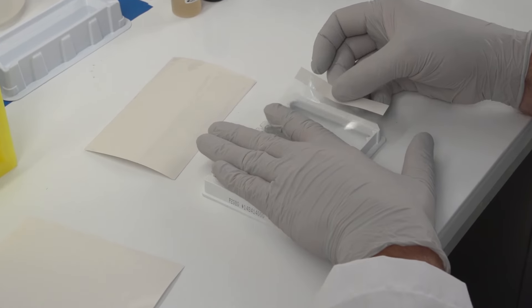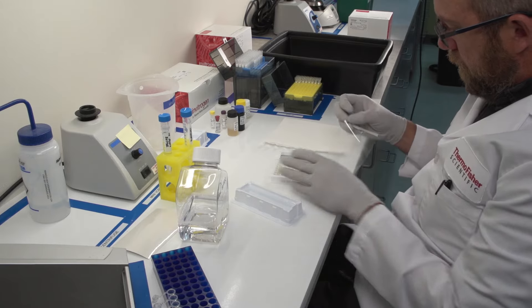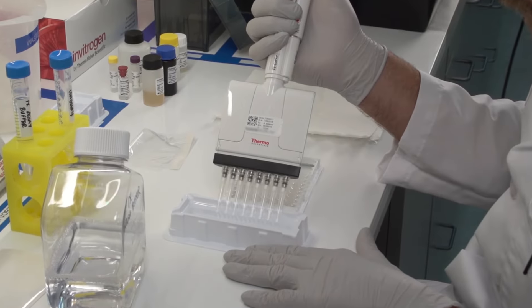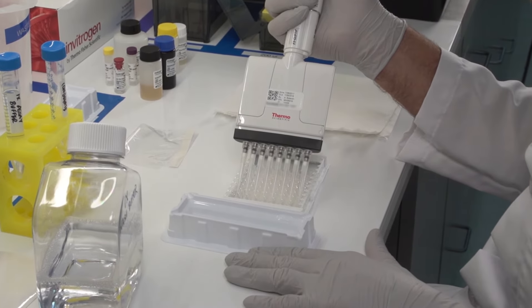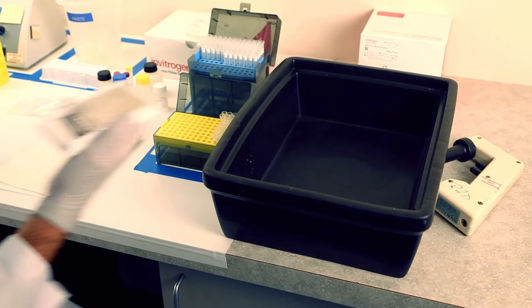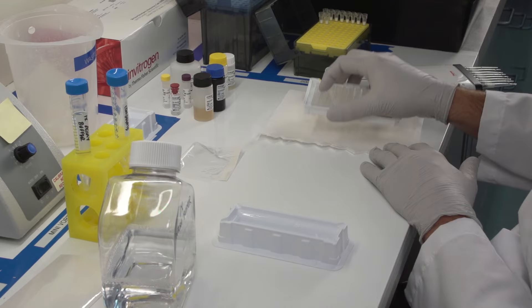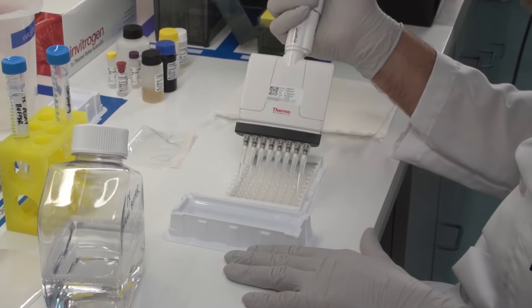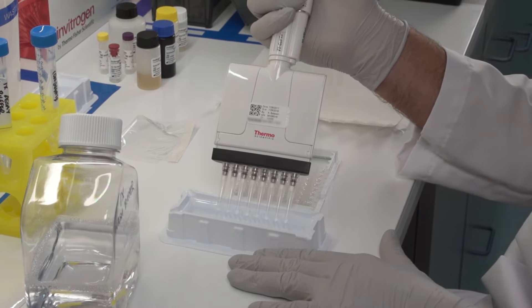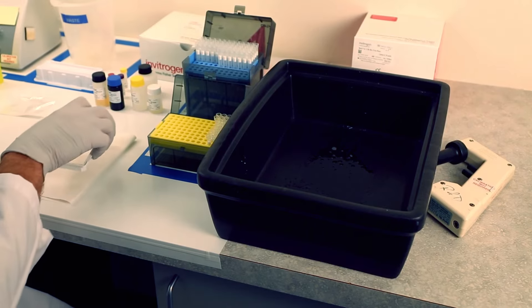Cover with an adhesive seal and incubate the plate. After the incubation is complete, either wash the plate manually or use an automated plate washer. To wash manually, fill the wells with wash buffer and allow it to soak as recommended in the protocol. Then decant by inverting the plate over a sink or container and shaking the fluid out. Repeat the wash steps according to the protocol. After the last wash step, invert the plate and tap it dry against an absorbent paper towel.